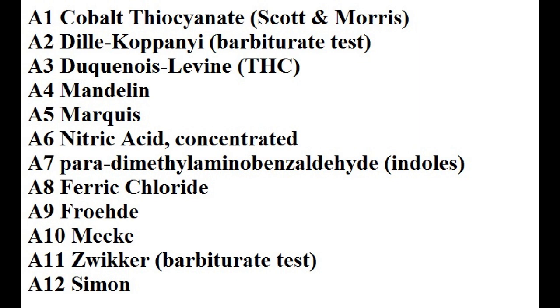We have ferric chloride all by itself, which seems to have very limited utility, although it can be used to test for morphine, which I guess is something. And then another guy whose name I can't pronounce. It seems like I've heard somewhere that this is pronounced Fruta. I have no idea. Help me out, people. Was I close? Then we have Mecke's reagent, and then a guy whose name looks German, in which case it would be something like Zwicker. And then a nice, I don't even know what, just common name, Simon. I know how to say Simon. Well, the rest of these are just, I don't even know. I'm not even going to try.